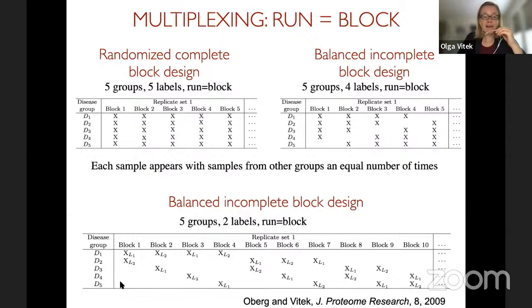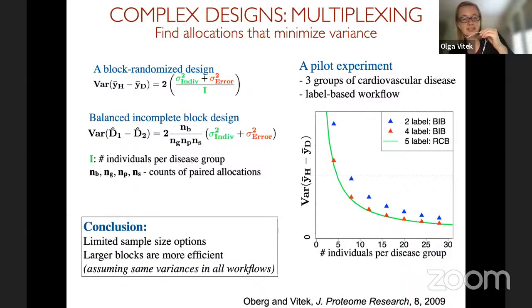In particular, with a reference sample, for example in SILAC, you can imagine spiking reference peptides for every endogenous run. This is actually less effective from the statistical perspective than doing this type of balanced design. And so this is how statisticians will think about that.